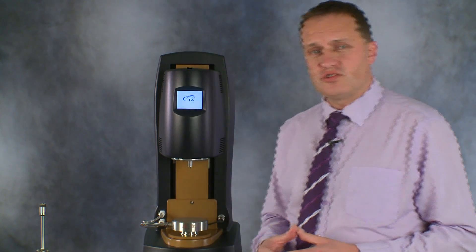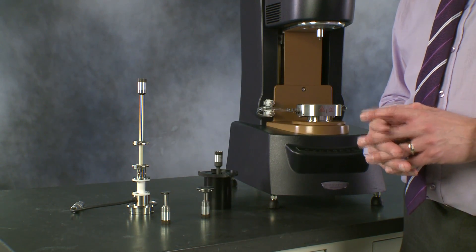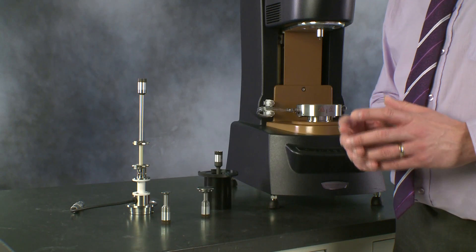Choosing the diameter chooses the surface area and that chooses the sensitivity. So we choose 60mm geometries typically for low viscosity fluids. We use a 40mm for samples that match typical household paints.